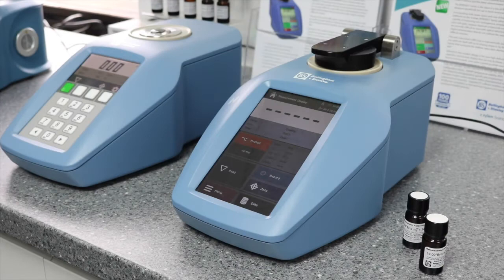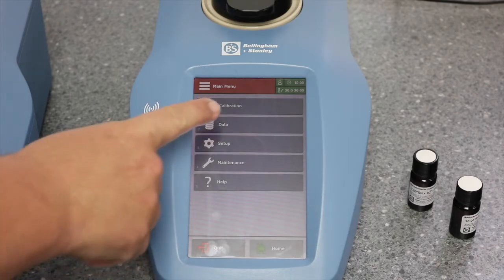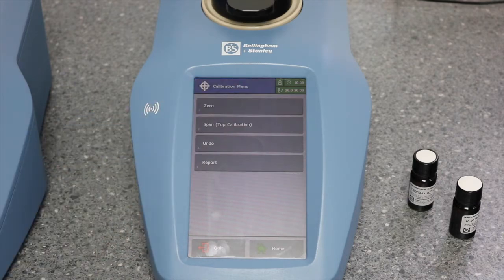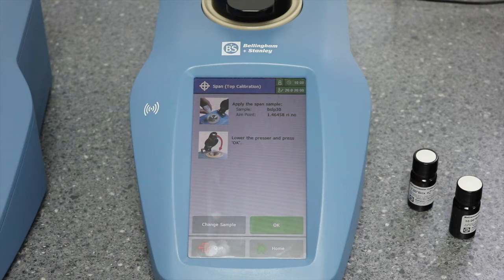How to calibrate span, what is known as top calibration, on the RFM300T refractometer. Press the menu button, press calibration, press span and follow the on-screen instructions.